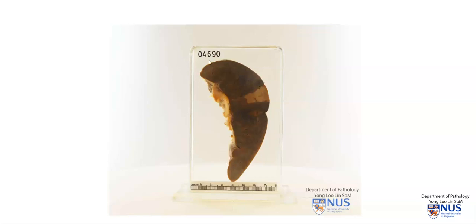Hello. Here is a gross specimen of a spleen and we're looking at the cut surface.